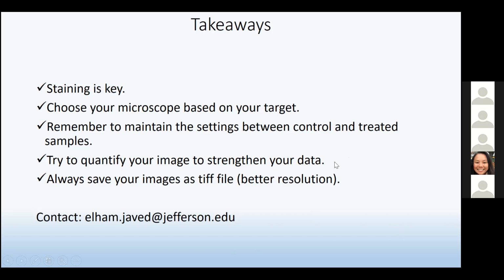Either use different co-localization methods, or just measure the intensity between your images and compare that way. And always please remember to save your images as a TIFF file, because it will give you better resolution, especially when you are transferring into PowerPoint and then to a PDF, because you end up losing a lot of resolution from the microscope itself to your PowerPoint and then to your PDF.